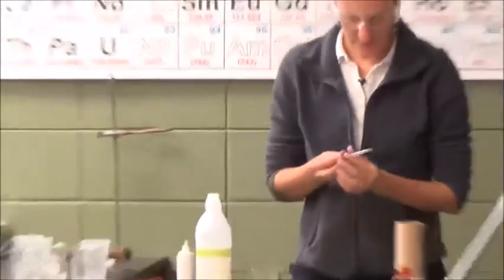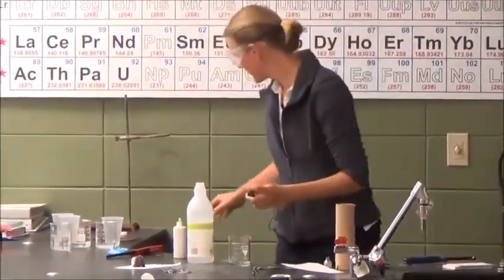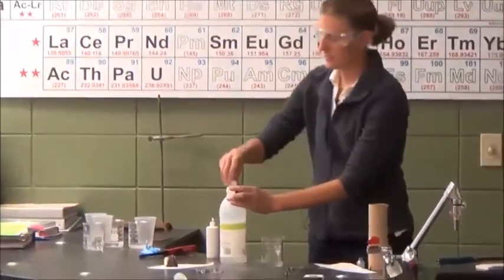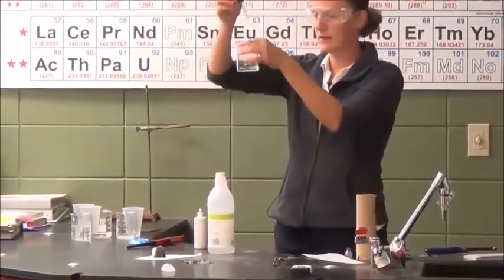We're down to ammonia, which is a cleaning product. Doesn't smell great. Never mix it with bleach. Whoops, that was the wrong cap. And an indicator called phenolphthalein.